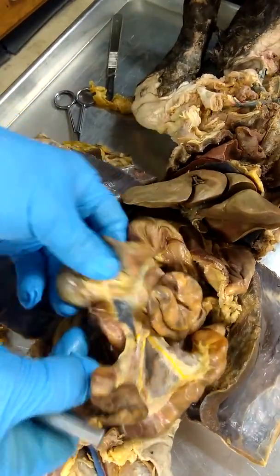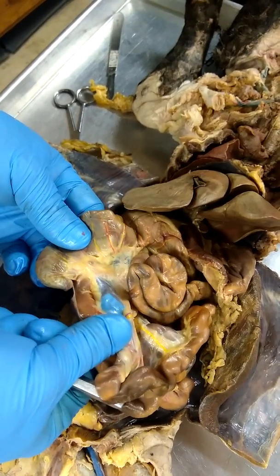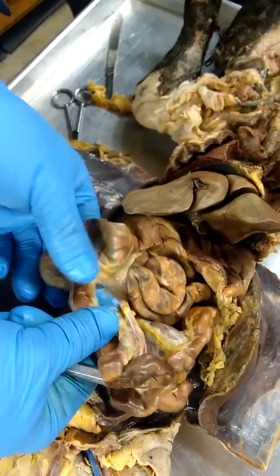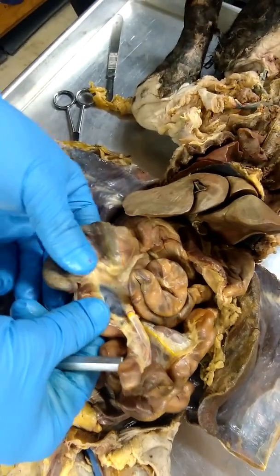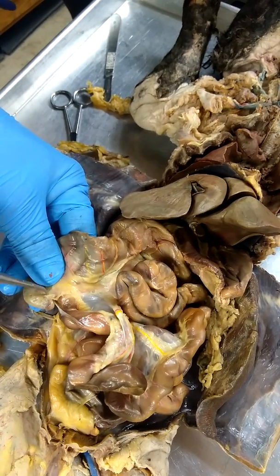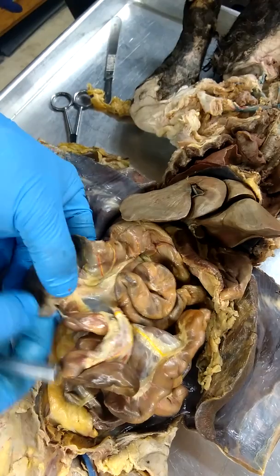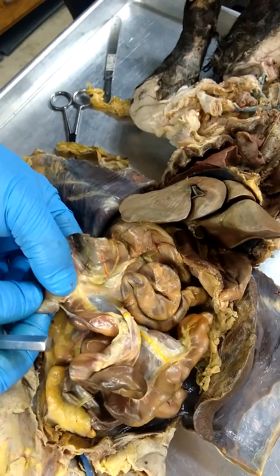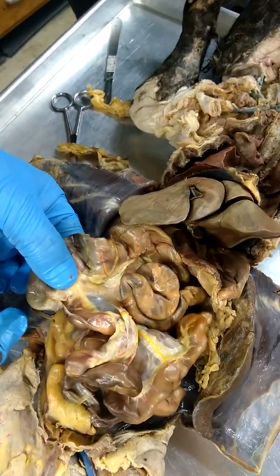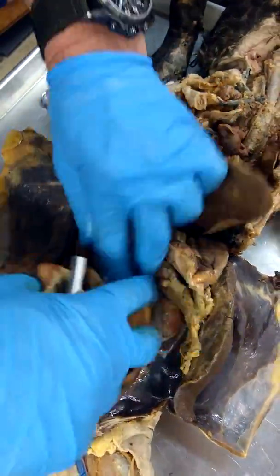So in this hand I have the large intestine, in this hand I have the small intestine. So see how much smaller that is? So this last section of the small intestine is called the ileum. That's the part that joins the large intestine. So at the ileum, this little dead end that doesn't go anywhere on the large intestine, this is called the cecum. Right here where the ileum attaches, you can feel a little structure there. That's the ileocecal valve.